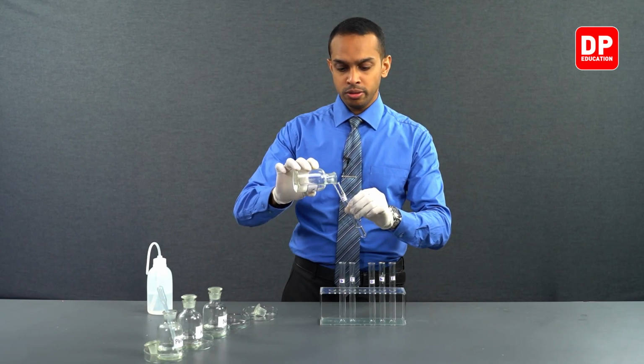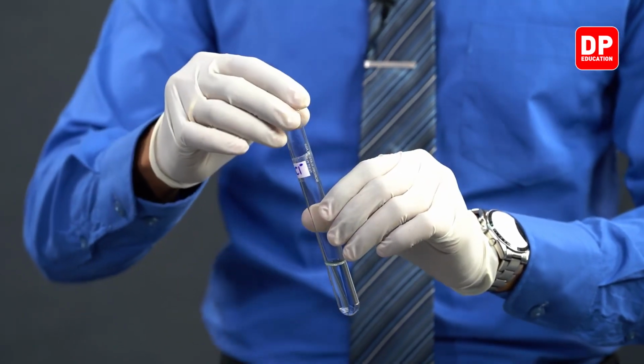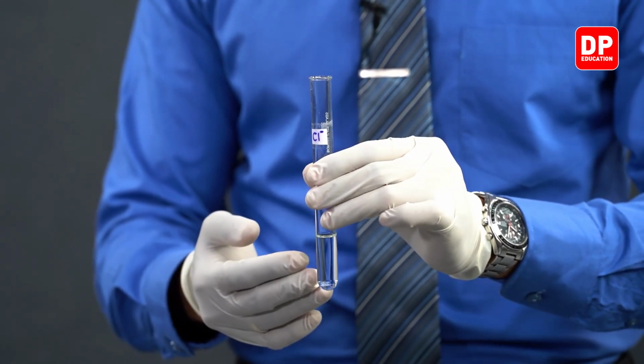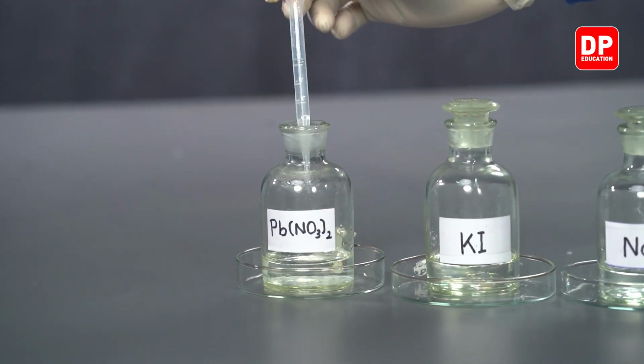Let's take a little bit more. And now to this solution that contains chloride ions, I will be adding a little bit of lead nitrate.